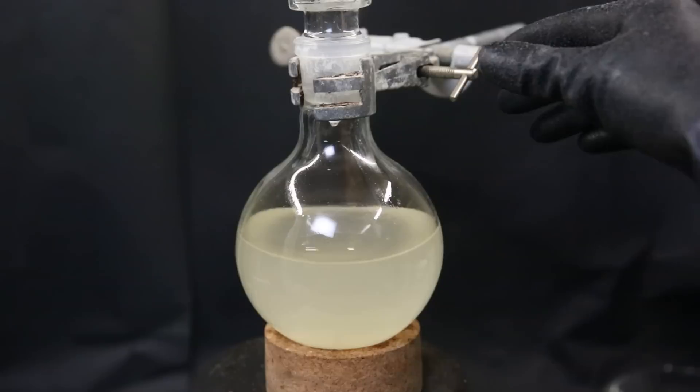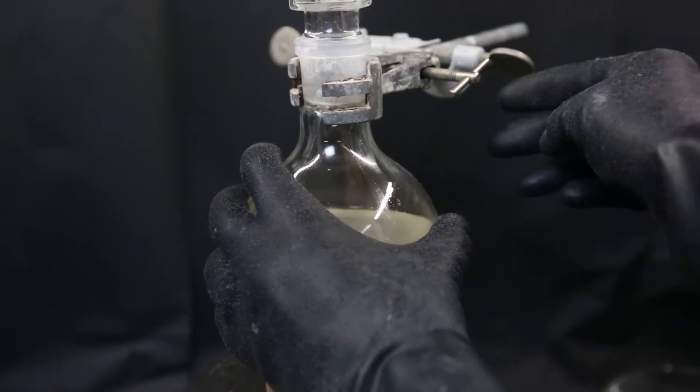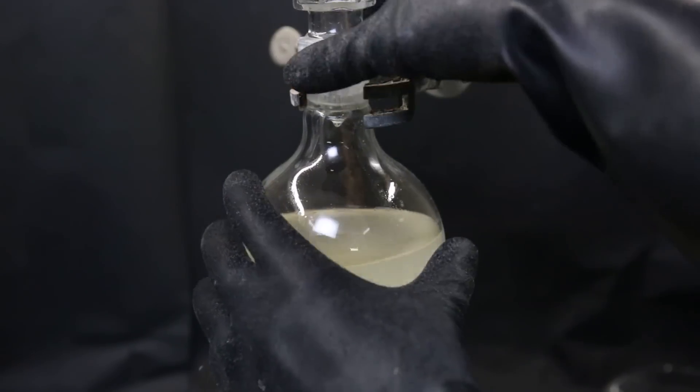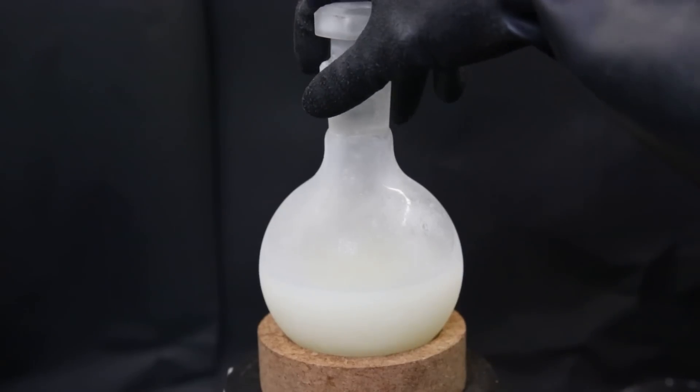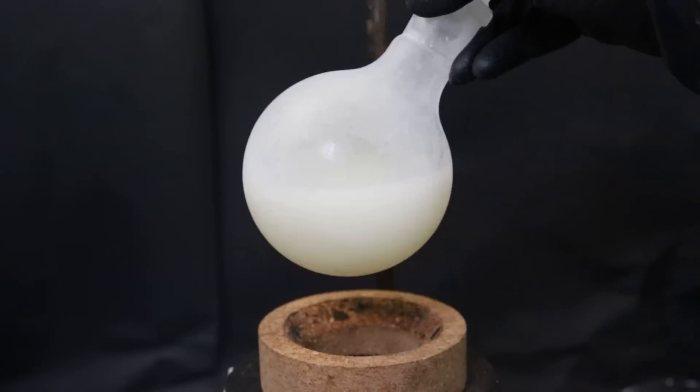Now to crystallize out as much of the product as possible, I will put it into the freezer at minus 26C for a day. After taking it out of the freezer, we can see a bunch of product has crystallized out.